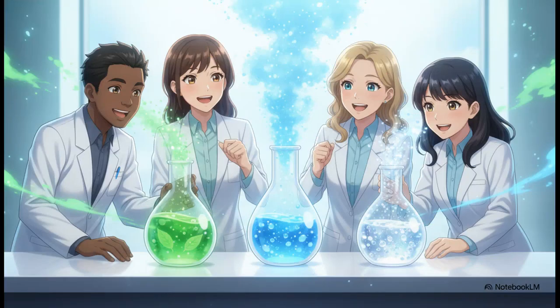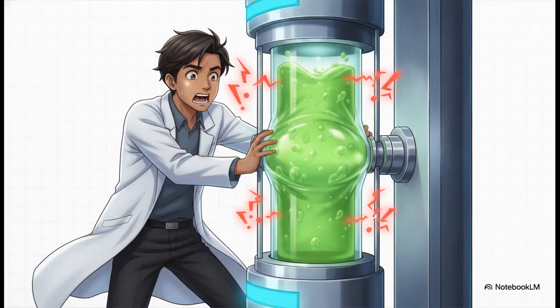The good news is, the scientific community is already testing some highly innovative alternatives. Ethanol is really leading the charge as a highly effective, safe replacement for pharmaceutical analysis. It's cheap, it's green, though it does have a slightly higher UV cutoff. We're also seeing the emergence of bio-based, eco-friendly solvents like acetone and ethyl lactate. And there's even wild research into using superheated pure water to eliminate organic modifiers entirely. How cool is that? But there's no free lunch in chemistry.